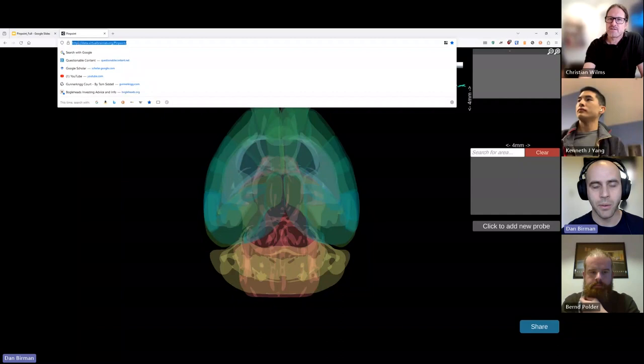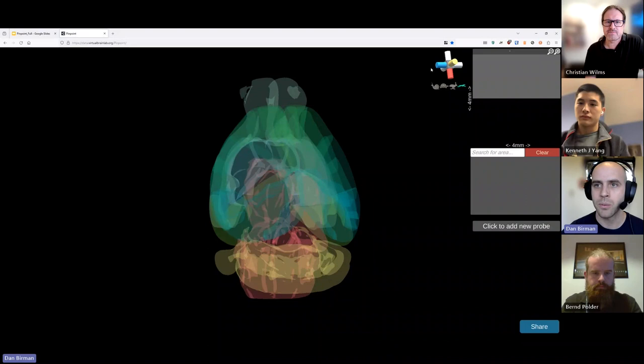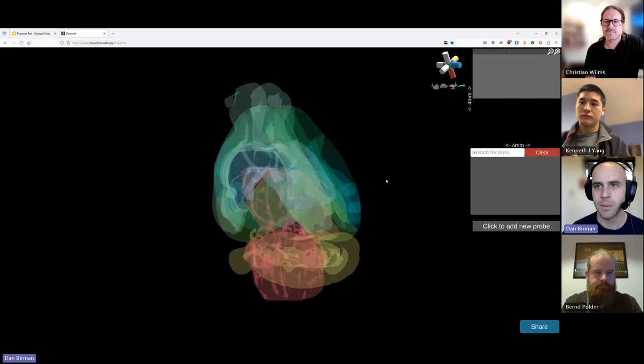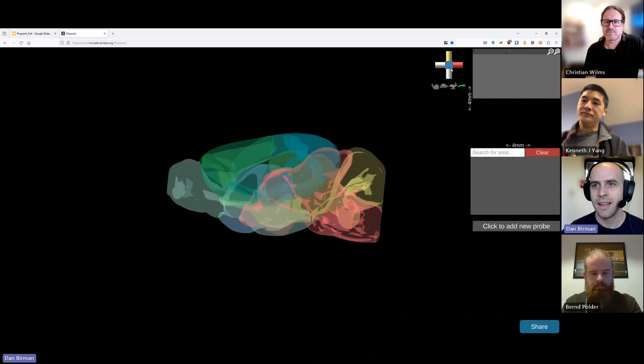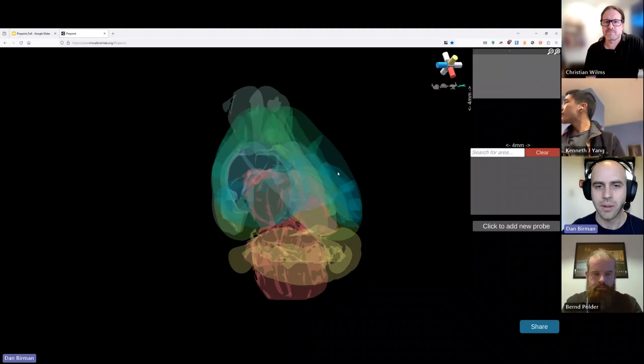This is Pinpoint. The website is data.virtualbrainlab.org/Pinpoint — you could pull it up right now if you wanted to. To interact with the 3D scene, you can left-click with your mouse and drag to move the brain in different directions. We have a little widget in the corner to help orient you to which direction the brain is facing, especially because it gets confusing when the brain is upside down. Double-clicking on these axes snaps the brain to sagittal, axial, and coronal view.